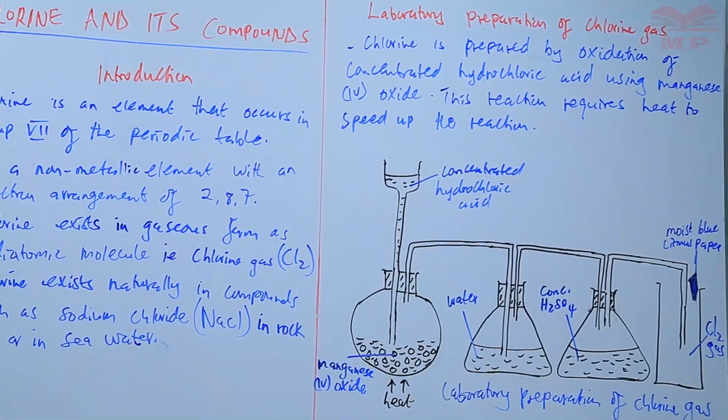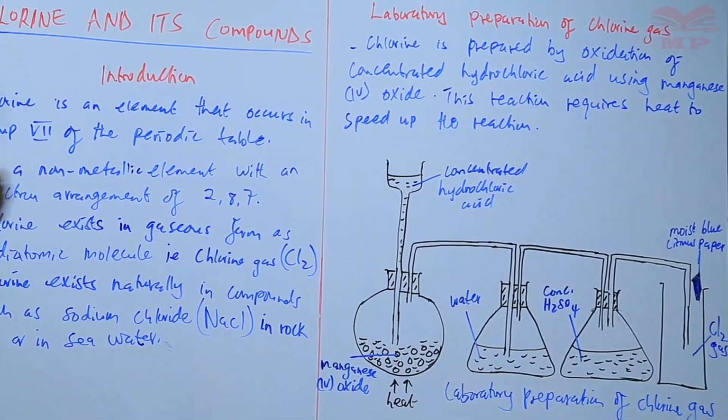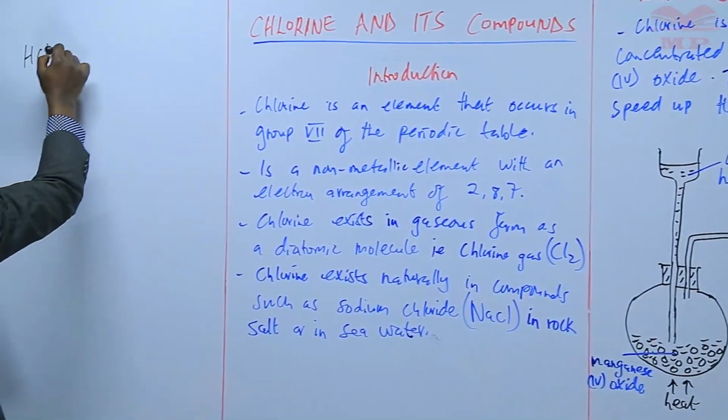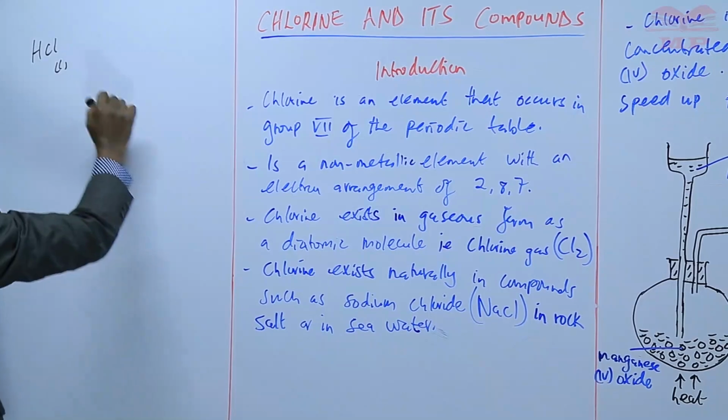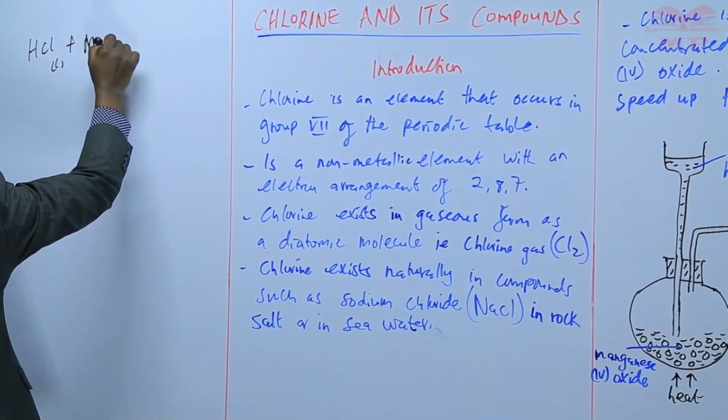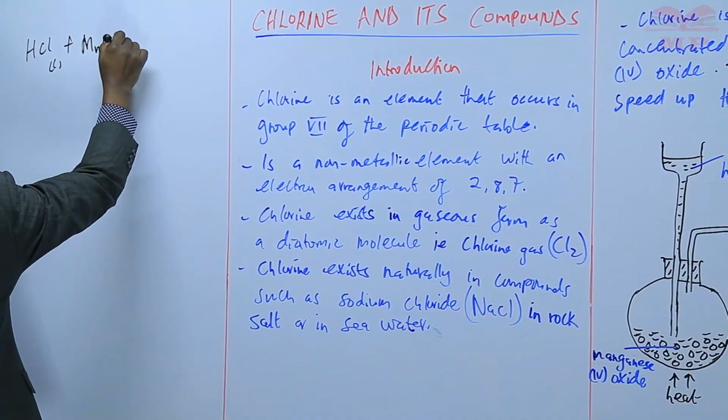So basically on that, we are saying that conc hydrochloric acid plus manganese 4 oxide, which is a solid.